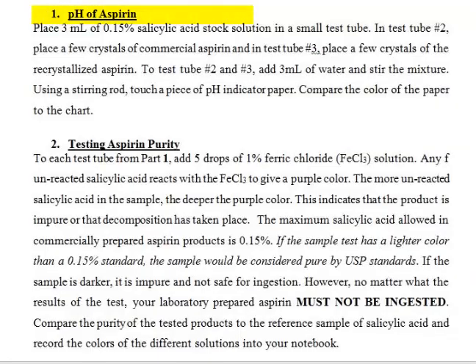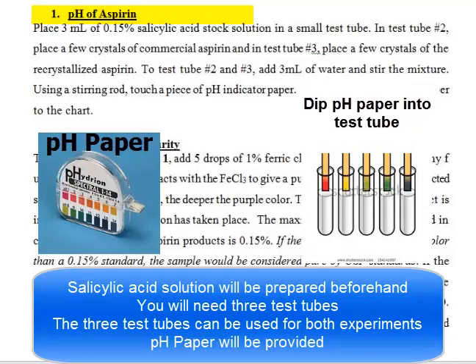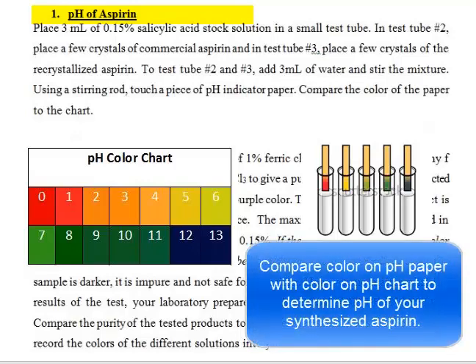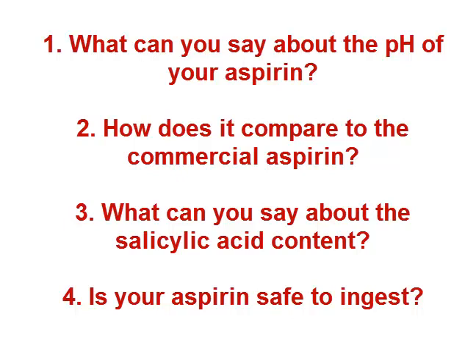In this experiment we're going to do two things: test pH as well as test aspirin purity. We'll get three test tubes — one with salicylic acid, one with our aspirin, and one with commercial aspirin. You test the pH by dipping pH paper into the test tube and comparing the color to a pH color chart, which tells you if something is highly acidic or basic. At the end you want to ask: what can I say about the pH of my aspirin compared to commercial aspirin?